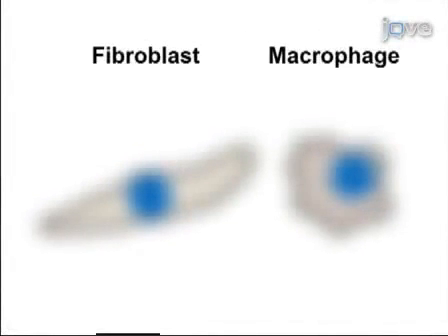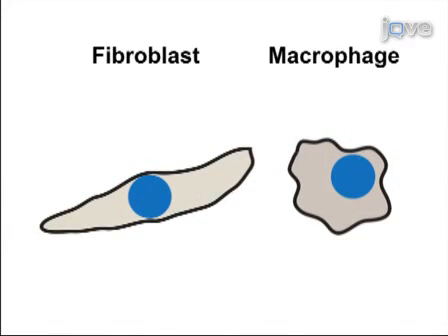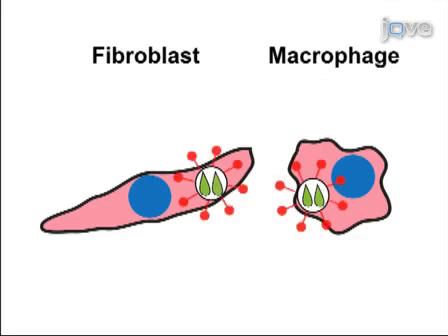The overall goal of this procedure is to induce and visualize cyst wall formation in Toxoplasma gondii in vitro. This is accomplished by first culturing macrophages and fibroblasts, and then by infecting these host cells with the parasite. Stress responses can be induced in T. gondii by shocking fibroblasts with pH or activating the macrophages, which will both lead to cyst wall formation. Finally, fluorescent lectin is added to the cultures, which binds to the cyst wall, such that cysts can be visualized with immunofluorescence microscopy.